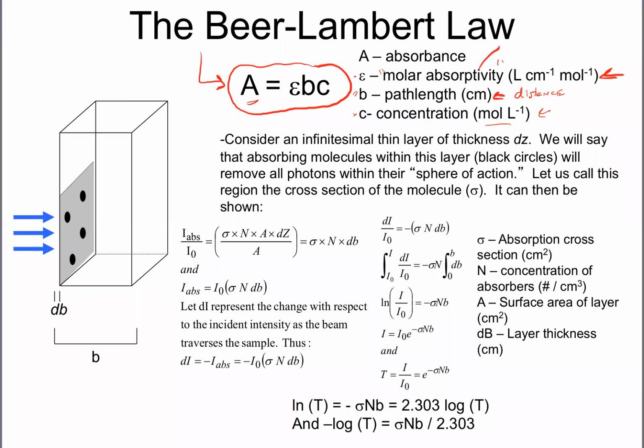Well, this one is, I like to say, kind of like a fudge factor that describes how well a molecule absorbs light at a very specific wavelength. Molar absorptivity is wavelength specific.